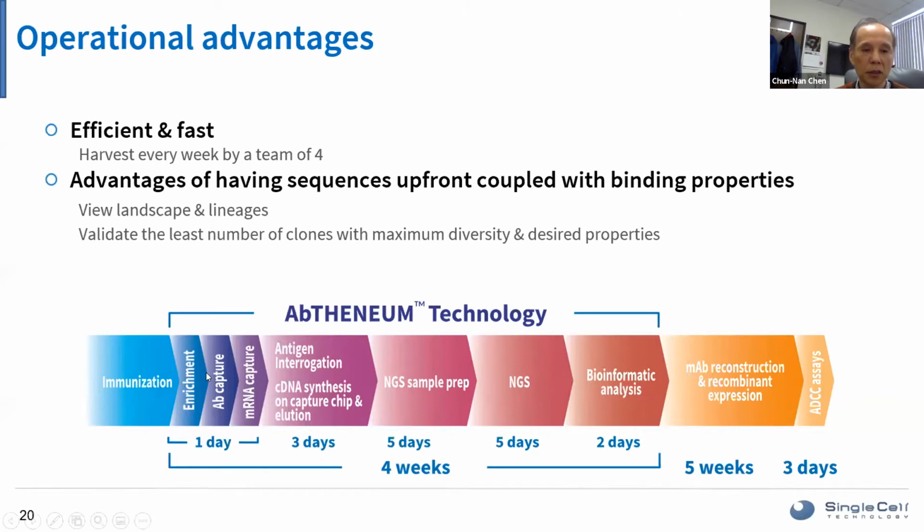The enrichment is taking the lymphocytes from lymph nodes and isolating the plasma cell population from that, and we spread that onto our Picoliter device and do our antibody capture. Depending on how many slides you want to capture, it can be a little longer day. And after that, you lyse cells and capture the mRNA overnight for convenience.